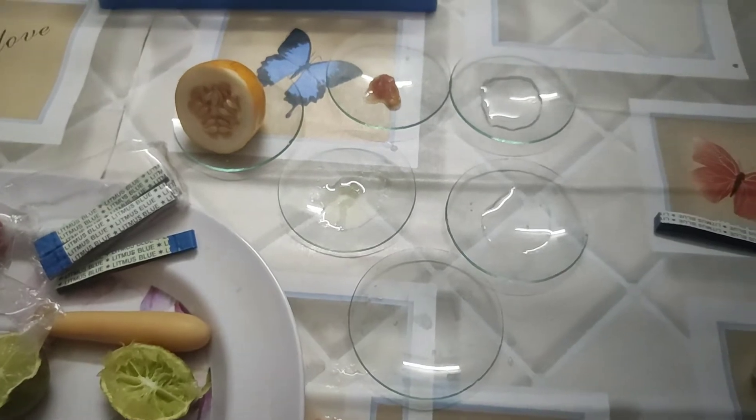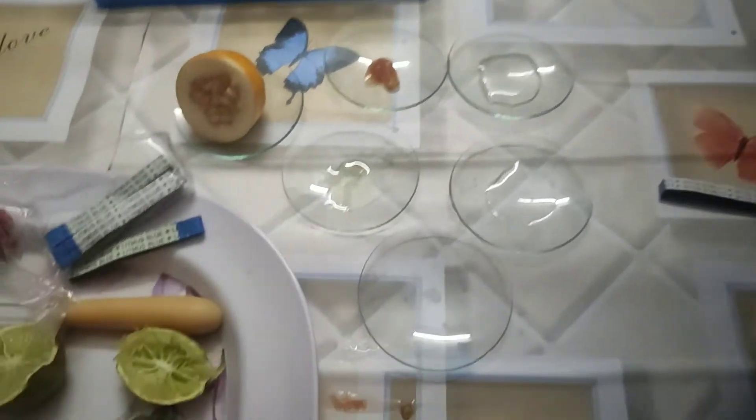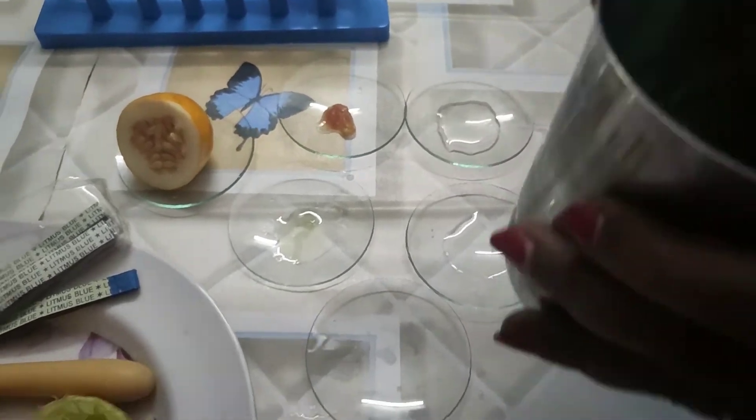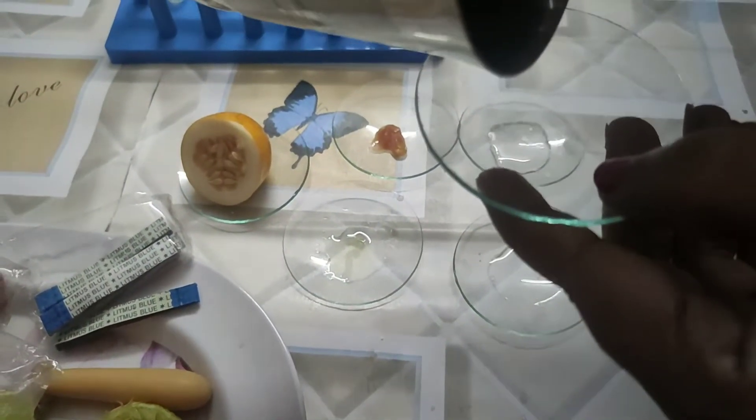These are the samples, and one more sample I wanted to take is soap water. I just have the soap, so soap water I am also taking in the watch glass.